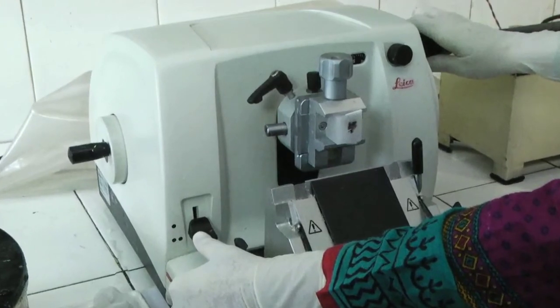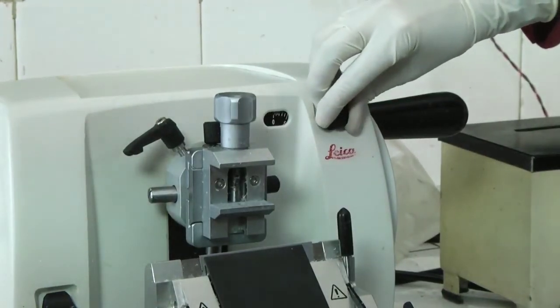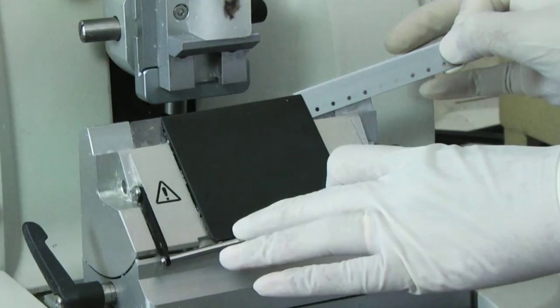The microtome is nothing more than a knife with a mechanism for advancing a paraffin block standard distances across it. The setting of the microtome, indicating the tissue thickness, should be checked before use. The important necessity for proper sectioning is to have a very sharp knife.